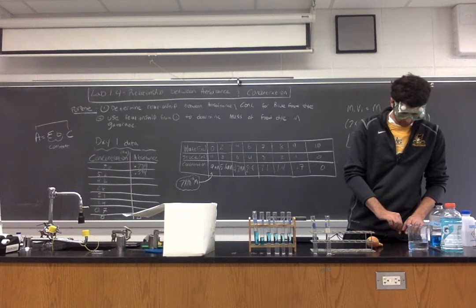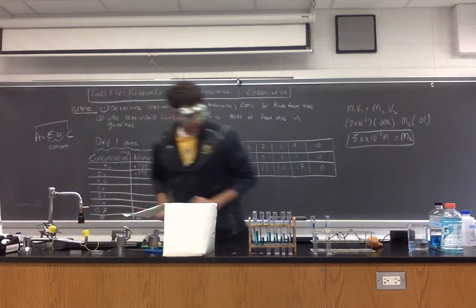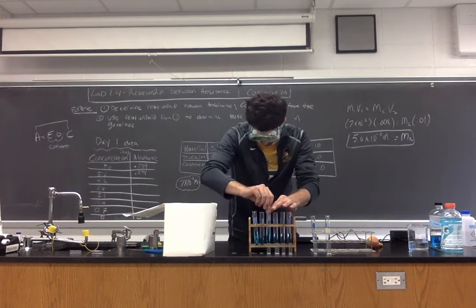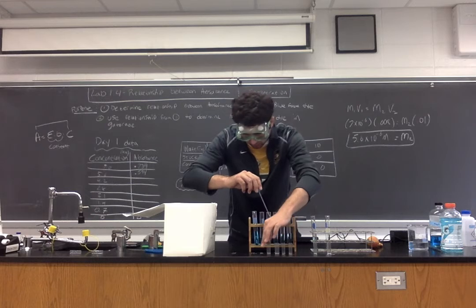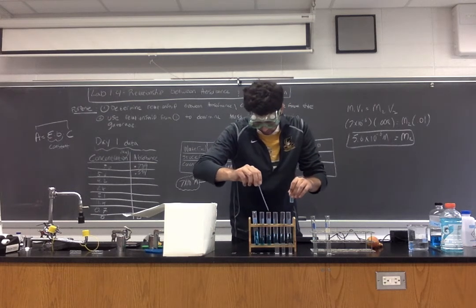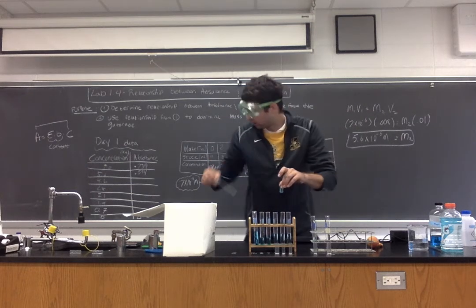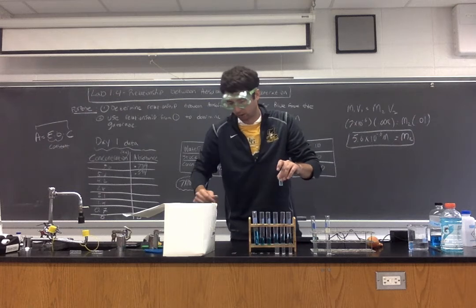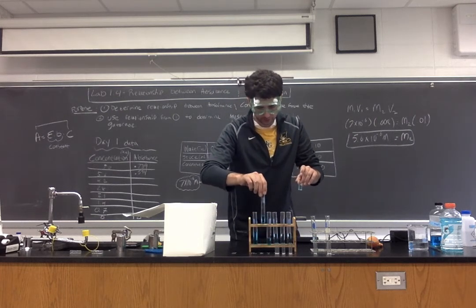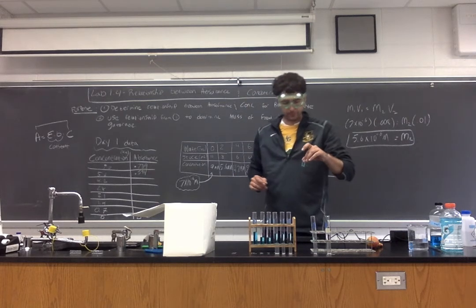Okay. Next solution. I'm also going to move these just to indicate when they have already been used, just to make sure we're not messing up any of our data. Okay?